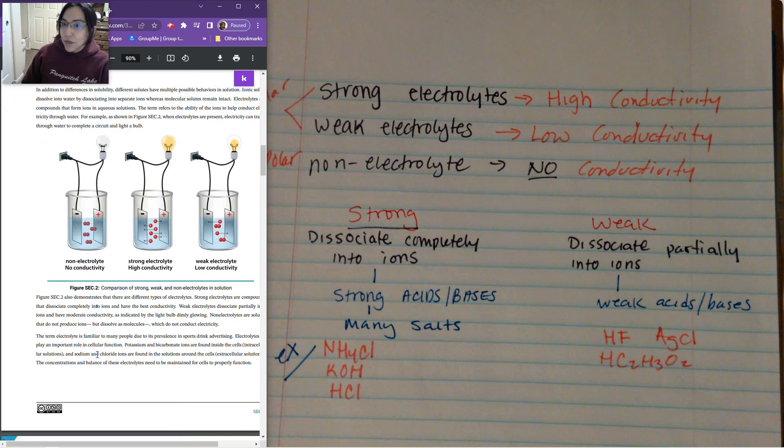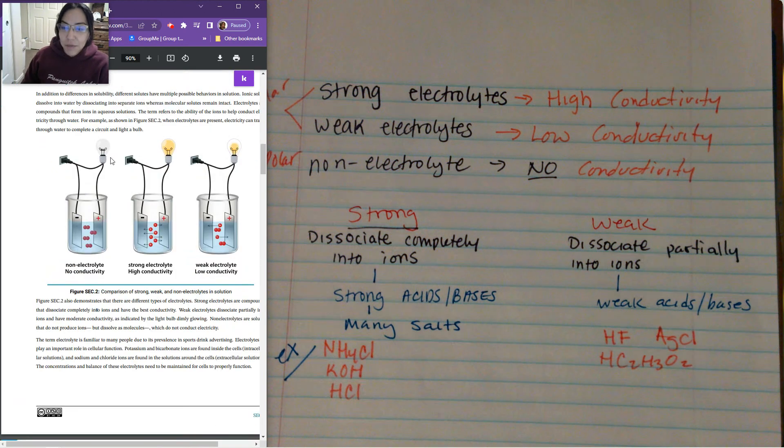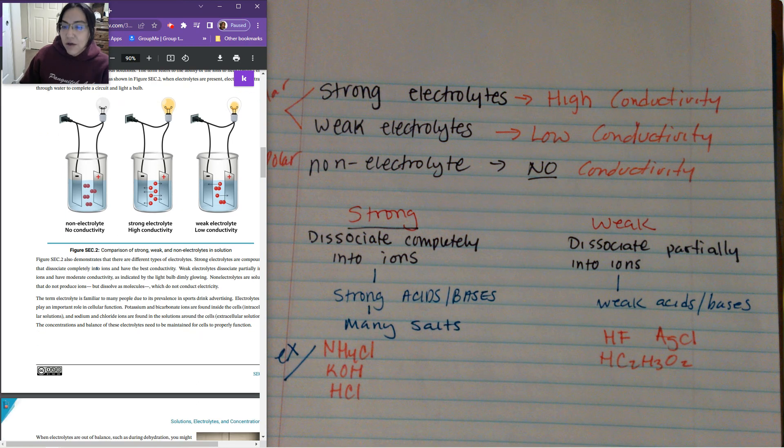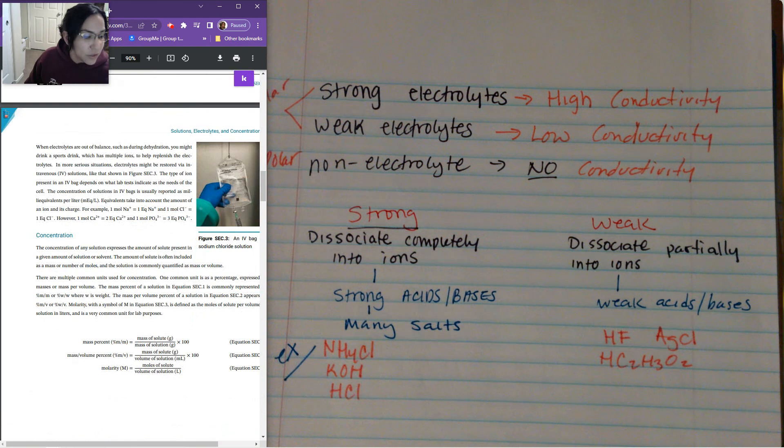So how do we test conductivity? Just simply try to charge something. So you can light a light bulb up and you can see how bright or how dim it is. You could put a cell phone in charge, those kind of things, depending on what your setup is actually going to be. Here we have a setup of two different products and rods connected to them and they're placed inside water. So that water is kind of acting like the medium between them. And when we have no electrolytes being produced, then you're going to see no light. However, if you have electrolytes being produced, you're going to see a light. You're going to see a dim glow or a bright glow.